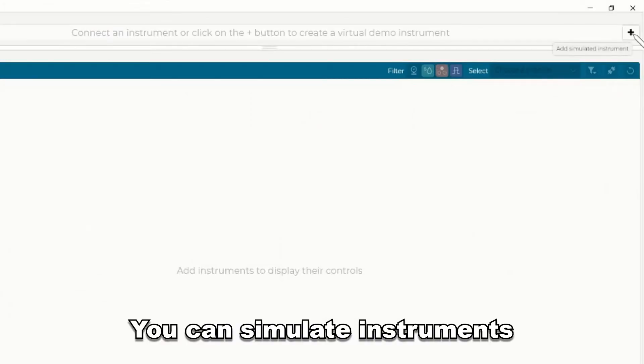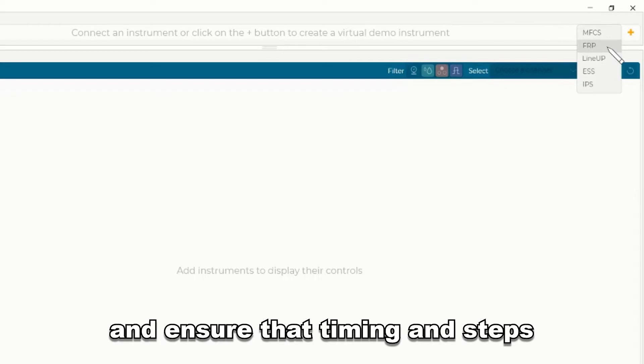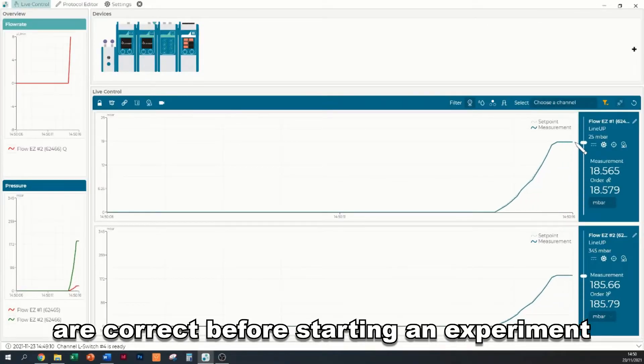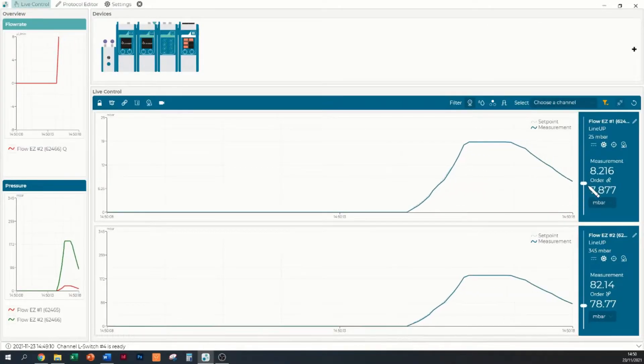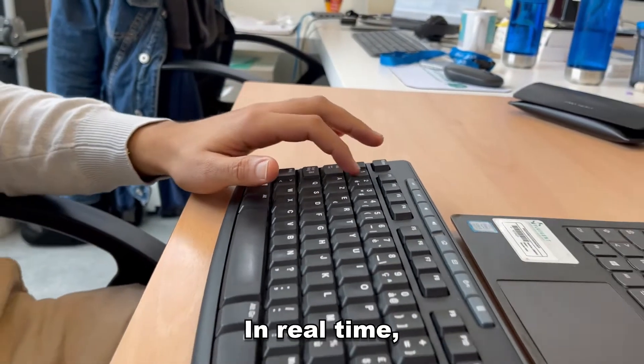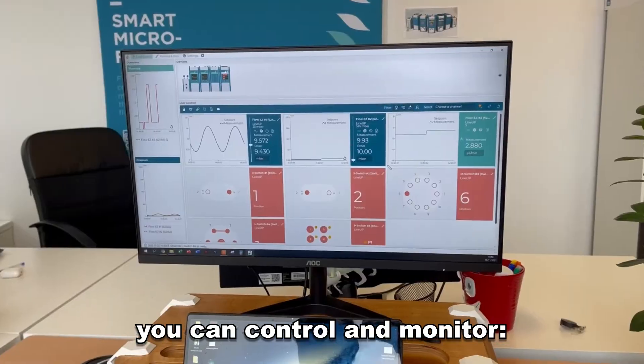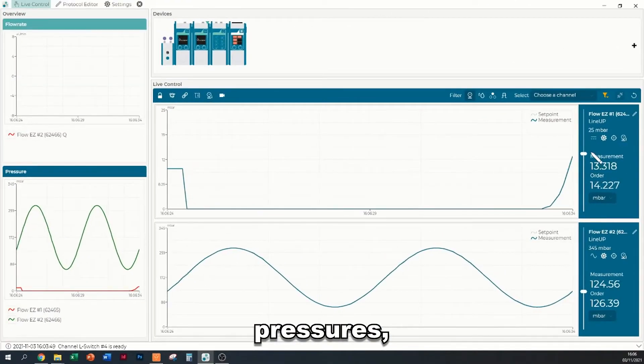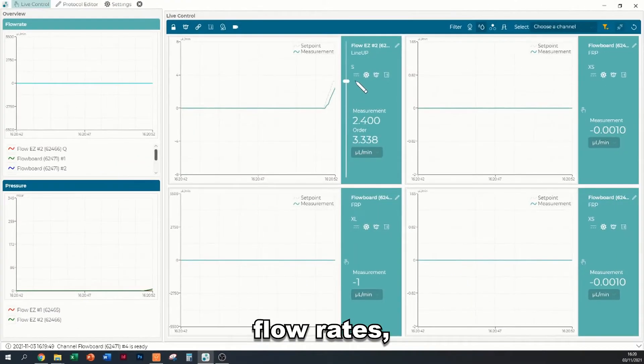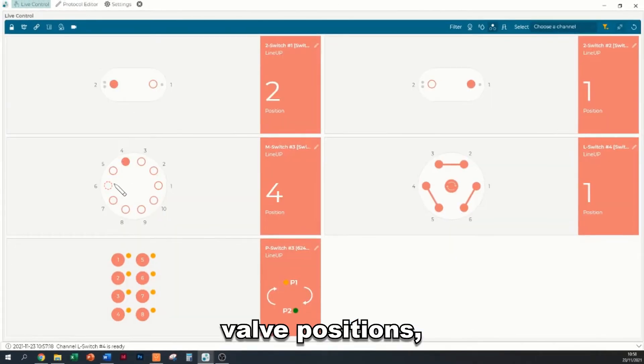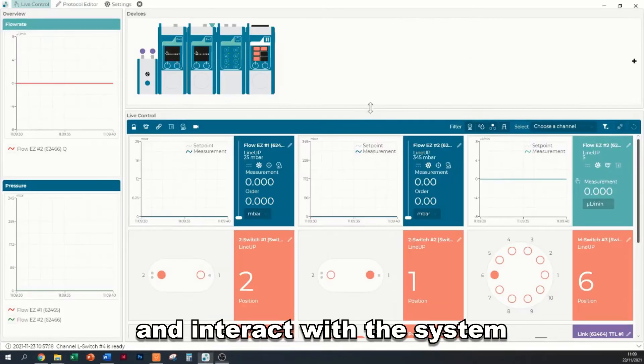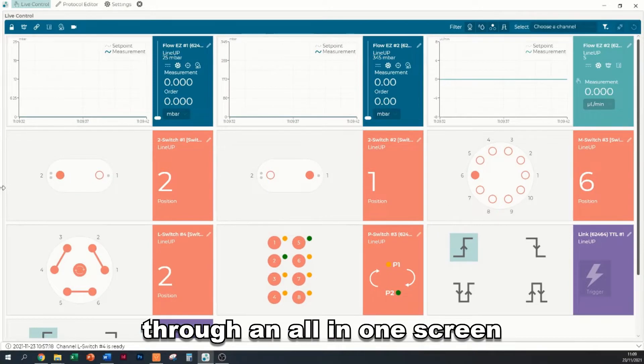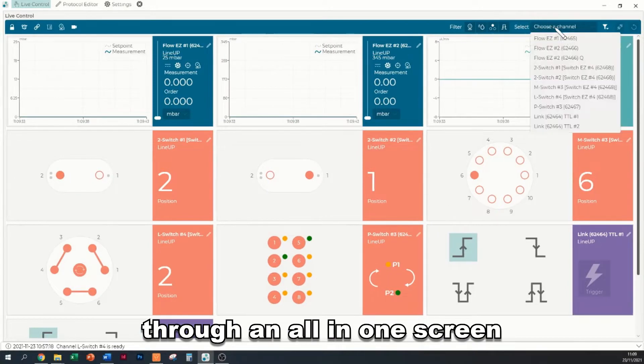You can simulate instruments and ensure that timing and steps are correct before starting an experiment. In real time, you can control and monitor pressures, flow rates, valve positions, and interact with the system through an all-in-one screen.